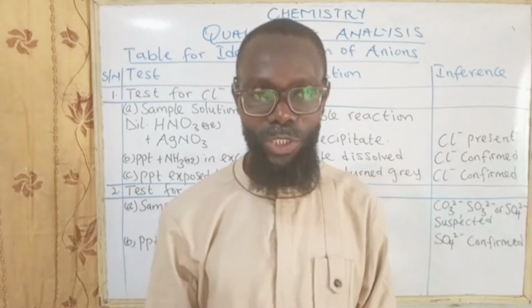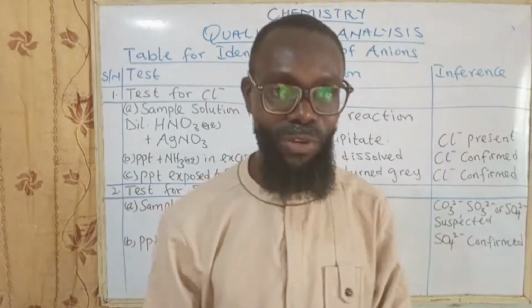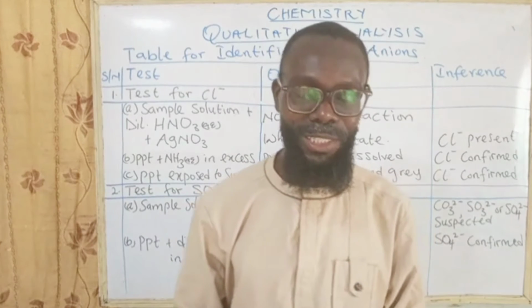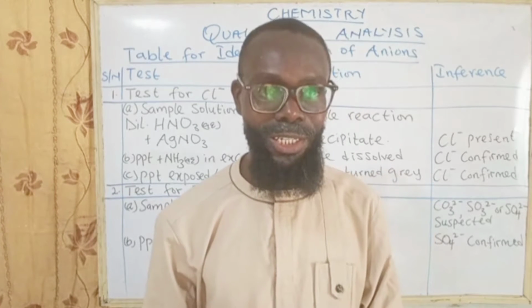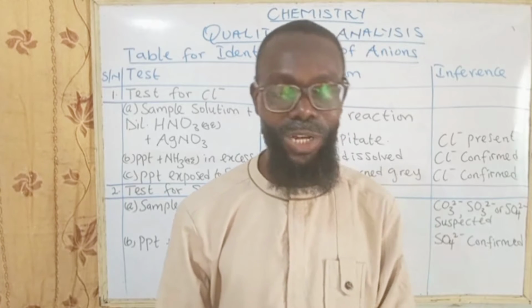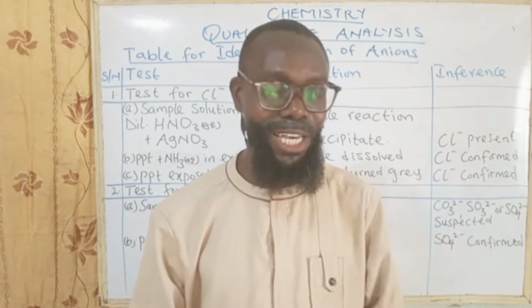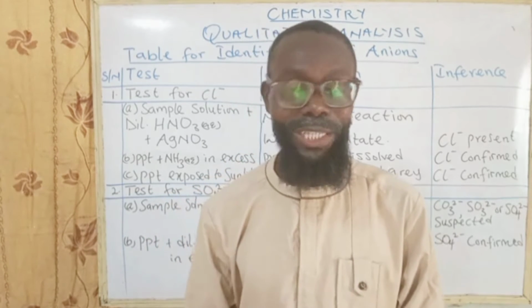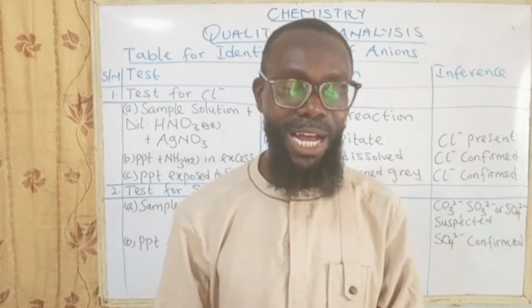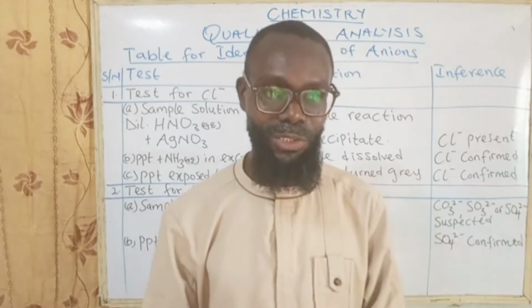Today is going to be the continuation of our qualitative analysis. If you could recall, in our previous class we discussed cations, that is the identification of cations and the reagents we use to identify cations. Today, we are going to be looking at identification of anions.